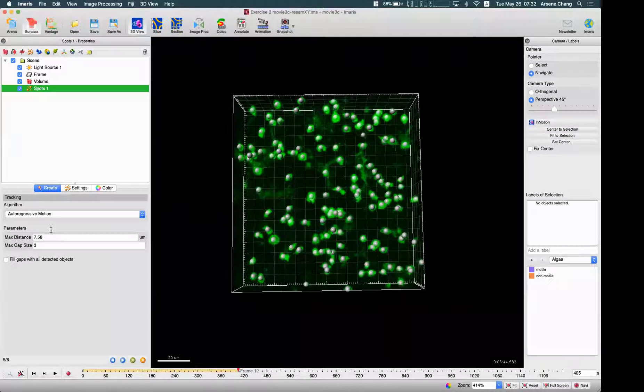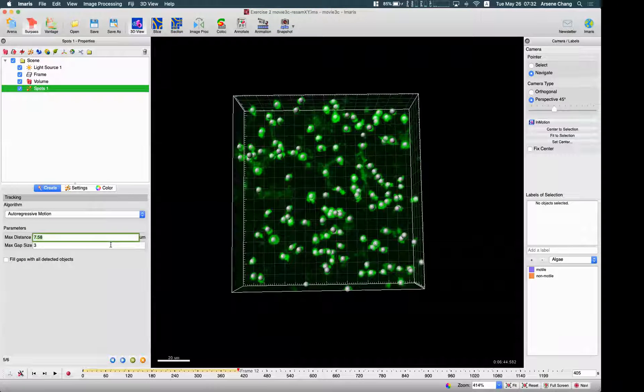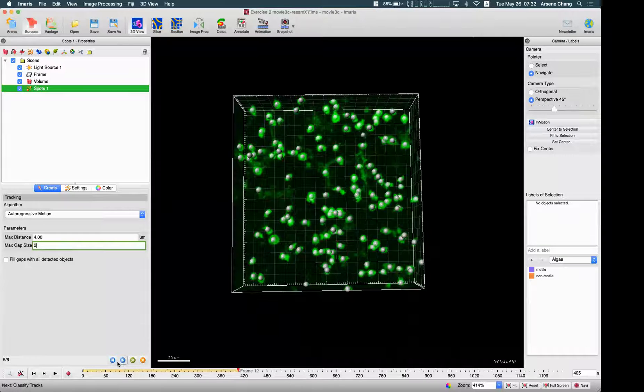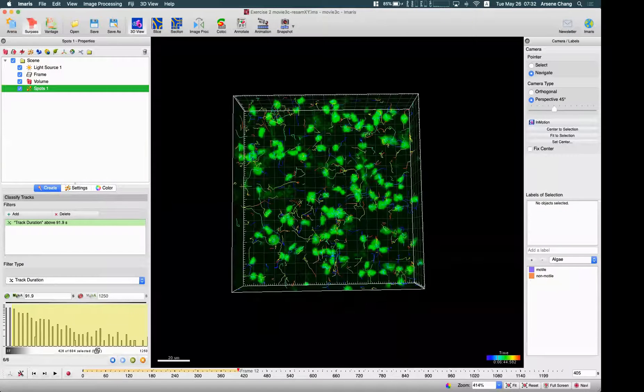Since it's not moving very fast, just a little bit, I'm going to use maybe four or five, keep the gap at two, and see how it goes.